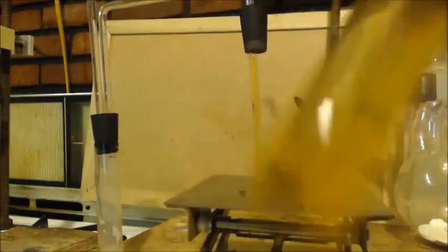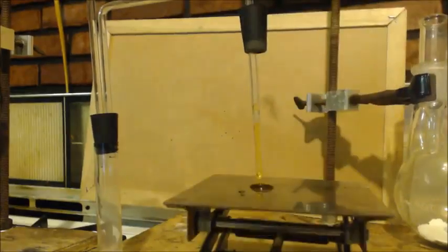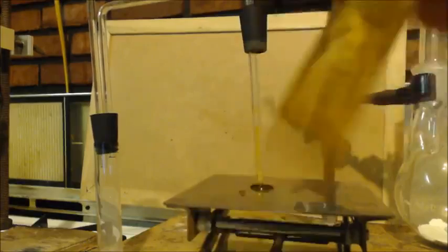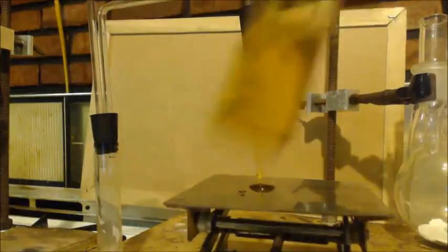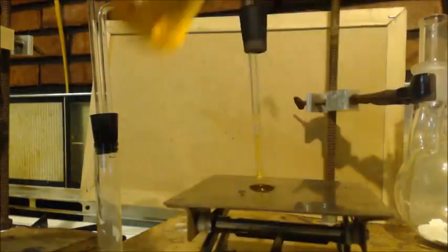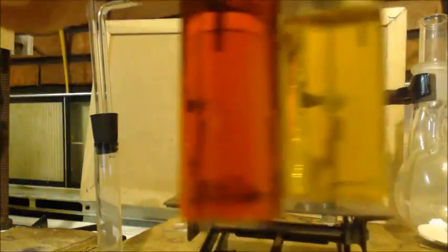I'm going to shake it up. Well, it's not clear enough. But I'll tell you why. It's because I put too much bromine in there, man. I put too much of it, whatever. Because look at the difference, though. It did take some of the bromine away. Look at that. I mean, that's almost clear. Compared.